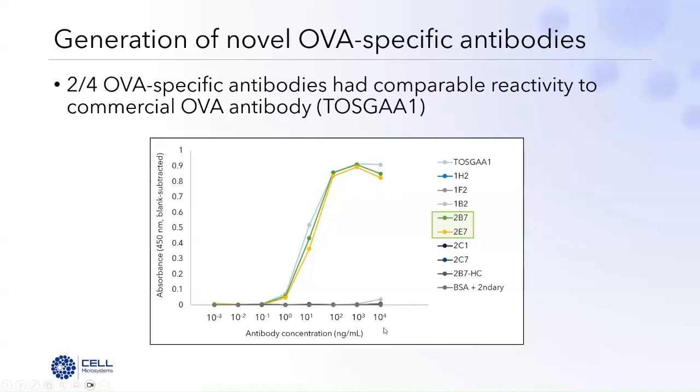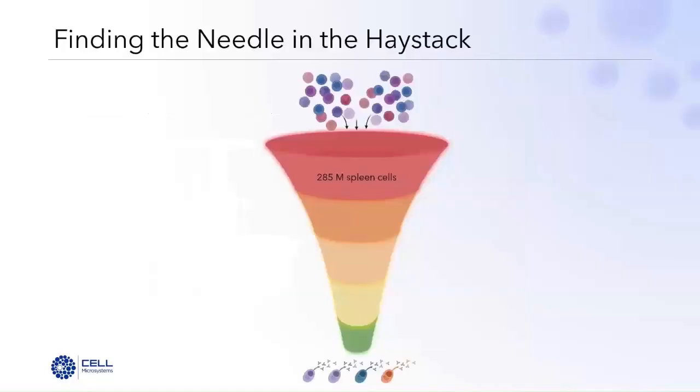And again, I think what this underscores more than anything else is the importance of having a large number of possible candidates in your funnel so that you can deal with the attrition that happens as you begin to winnow down to your antibody of choice. So I think this funnel we call finding the needle in a haystack, because when you think about the scale that we had to go through to interrogate these B cells to find a single antibody sequence, it's fairly staggering.